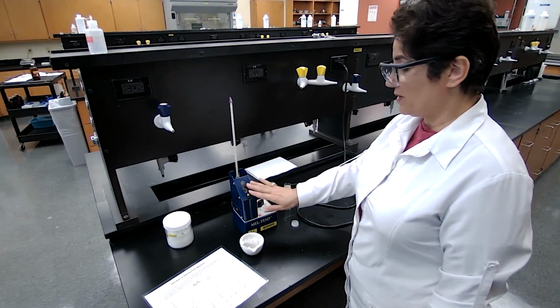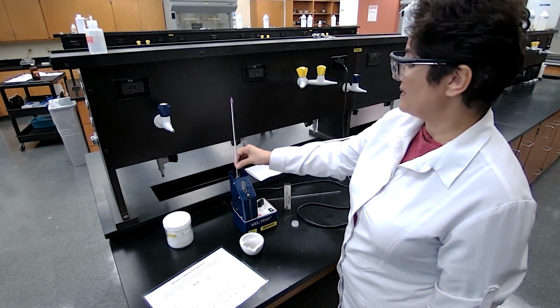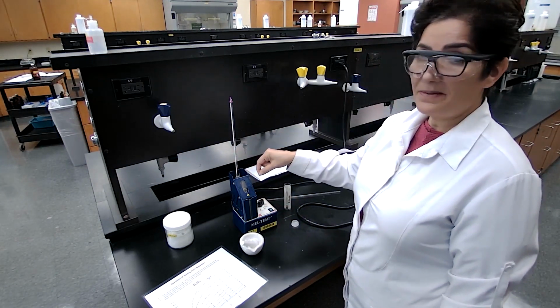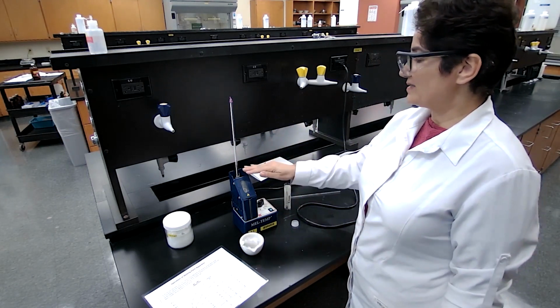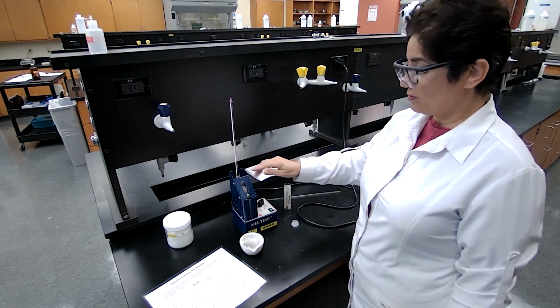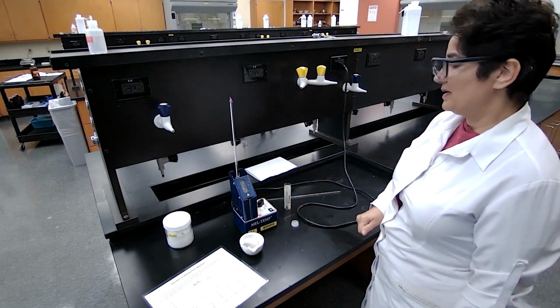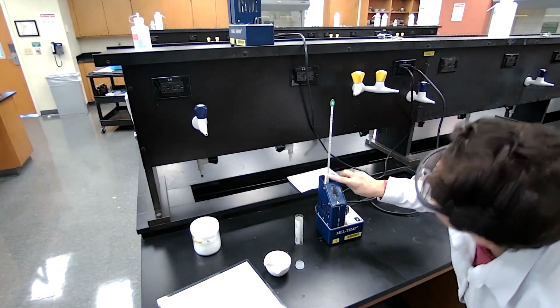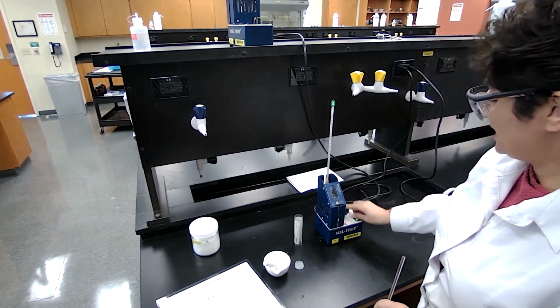If the thermometer is already showing a higher temperature, as soon as I put the sample in, it would melt, so it defeats the purpose. The temperature has to be 10 degrees lower than the melting point of my sample. The temperature is around 30 and the setting is at 2.